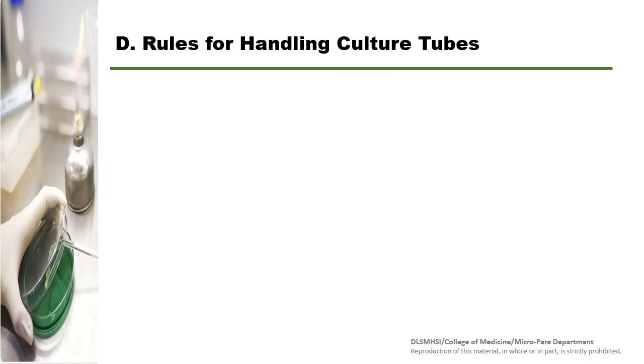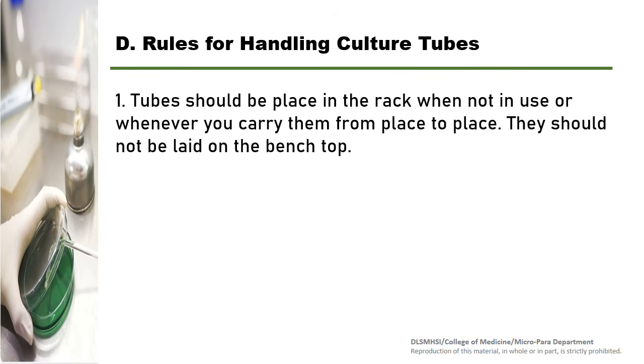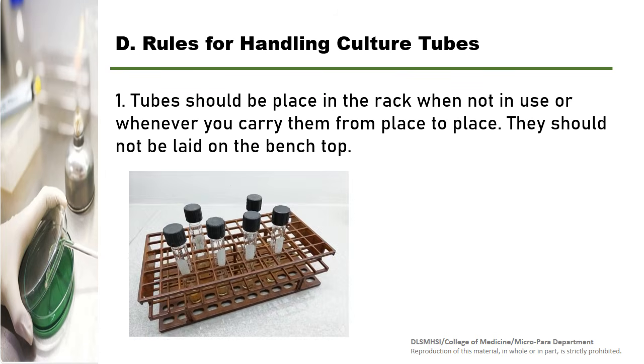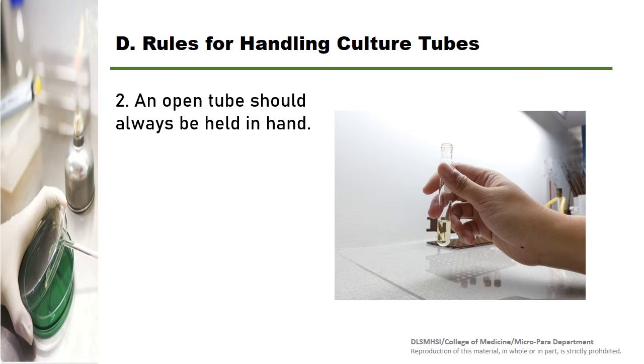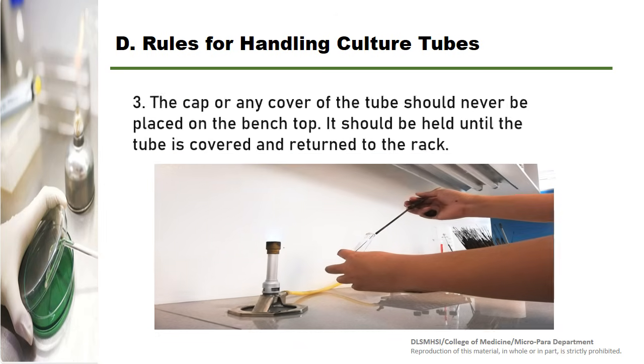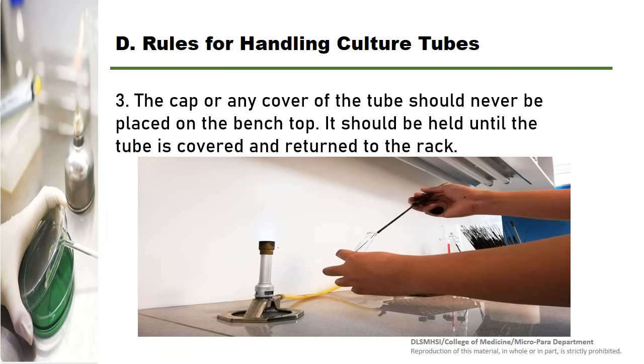Now we have the rules for handling culture tubes. The tubes should be placed in the rack when not in use or whenever you carry them from place to place. They should not be laid on the bench top. An open tube should always be held in hand. The cap or any cover of the tube should never be placed on the bench top. It should be held until the tube is covered and returned to the rack.